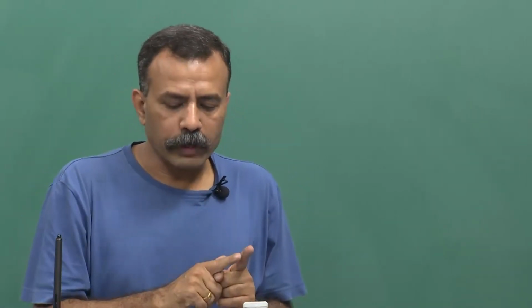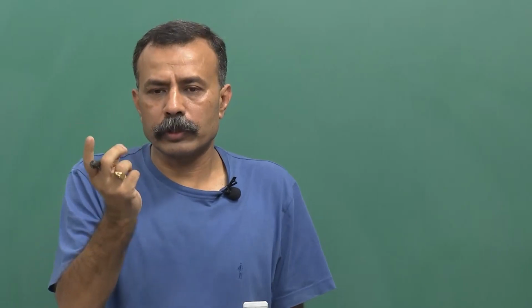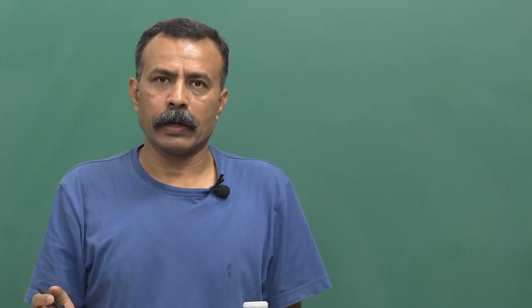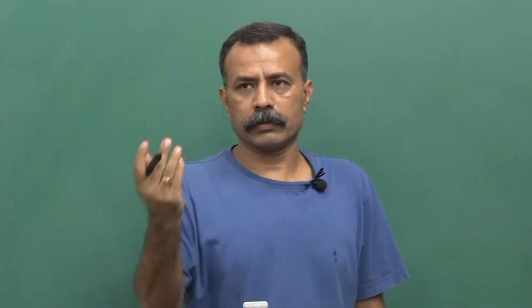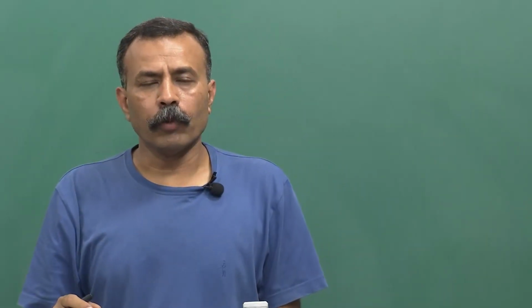And apart from it, if you remember where we talked about entering inside the lab, if you think of this zone where you are entering, there are something called sticky mats. These sticky mats are basically, if you put your feet on them, they are there to trap the dust. It's kind of a dust reducer in the system.